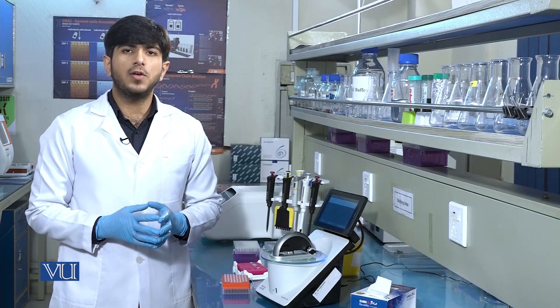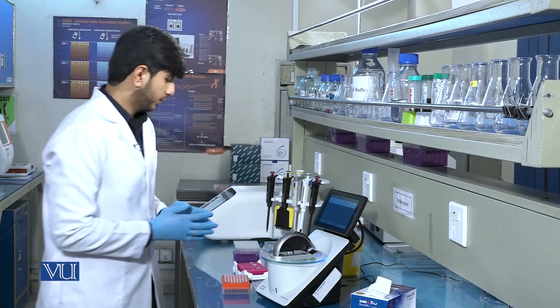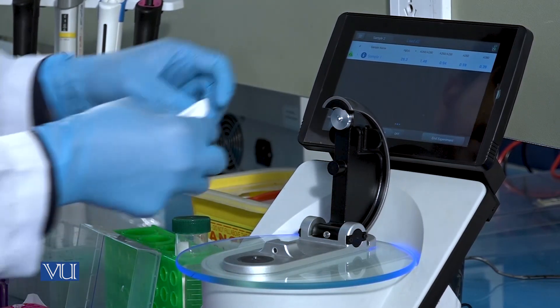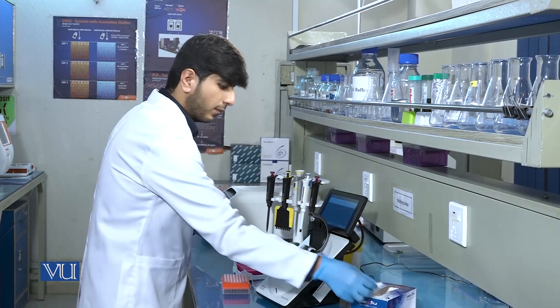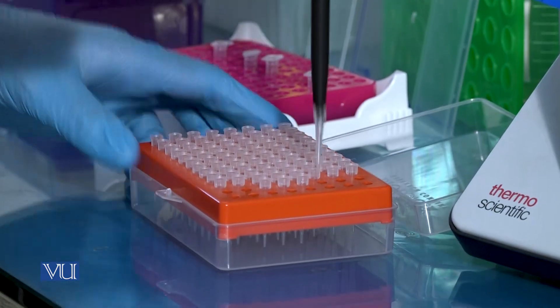Likewise, we can also run a second sample to check the DNA concentration. We will again clean the tips and add 1 microliter of DNA sample.